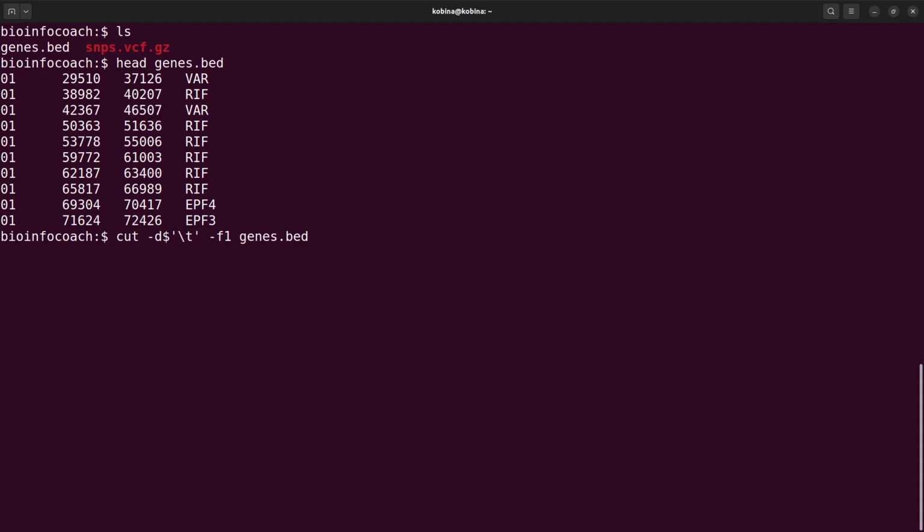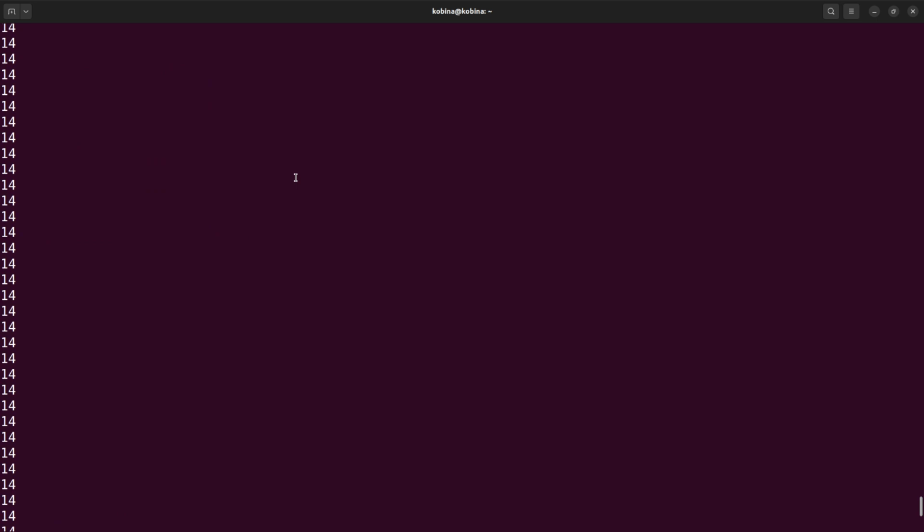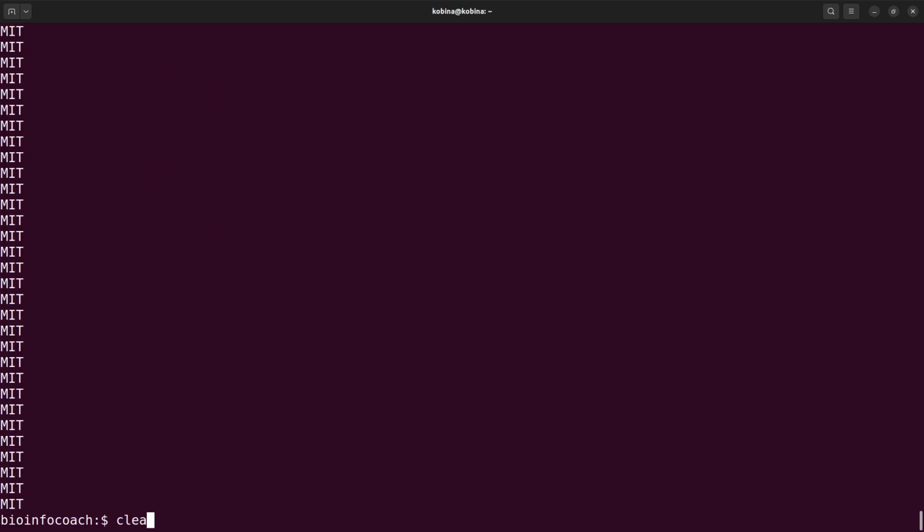Now this command is just for demonstration, so you don't need to run this particular command, but if you still want to do it, that's fine. So I'll run it and I have lots of chromosomes here. I have a lot of them. Now let's clear the screen.